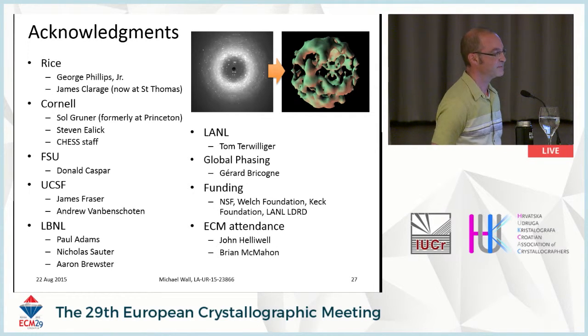I enjoyed it. Do you have any ideas about, let's say, guiding people in collecting diffuse scattering images? I mean, if we do a single crystal data collection and you have a rough idea of what the I over sigmas would be for reflection on the edge of the resolution limit, is there any way, or do you have any experience with how to determine this for diffuse scattering? So what should be the signal over noise in the background or in diffuse scattering? Do you have any guidelines?